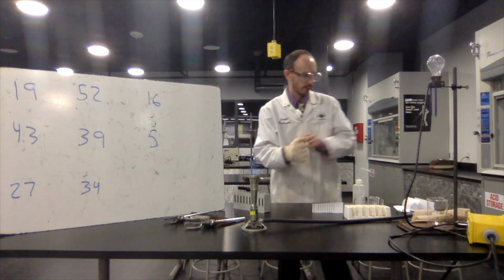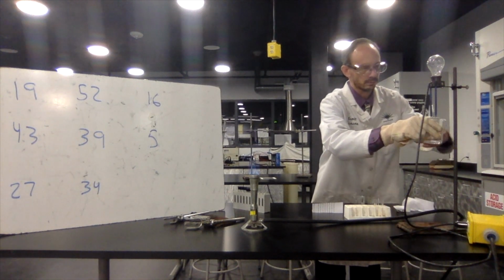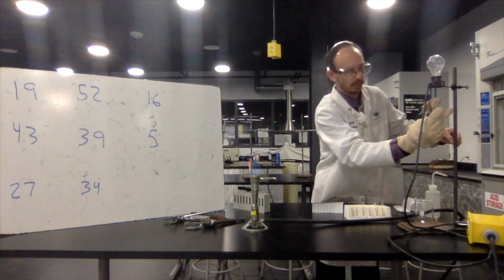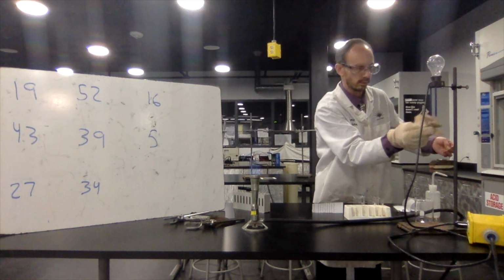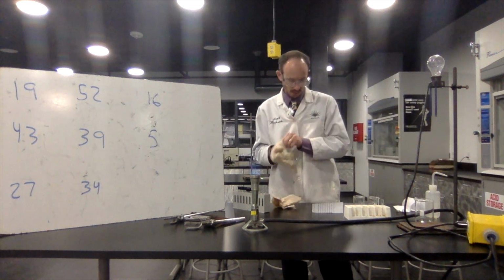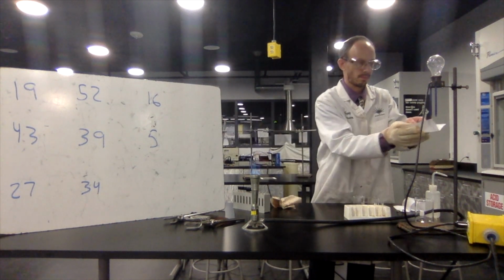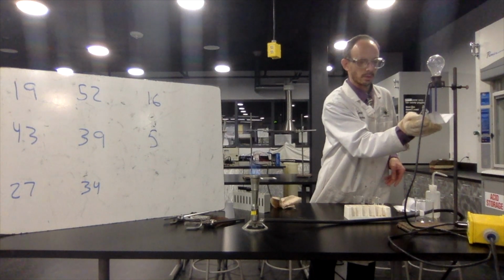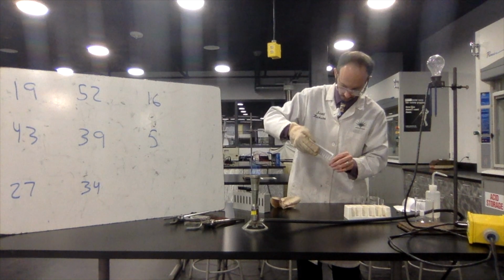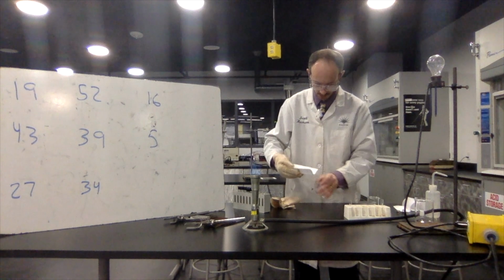So now I am going to rinse and dry my two probes. Okay. And let us check for conductivity. There is none. Pour a little into here. Pour the rest into here.